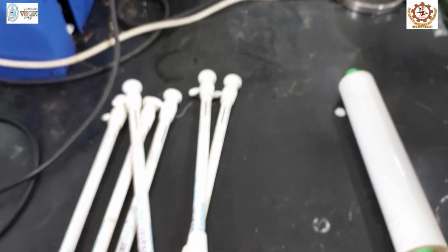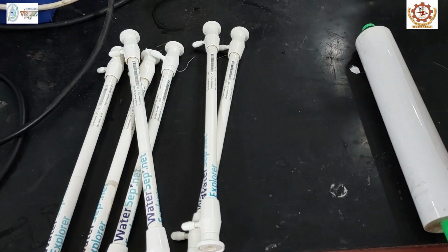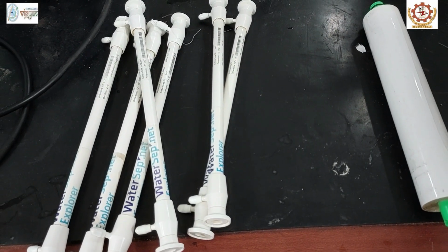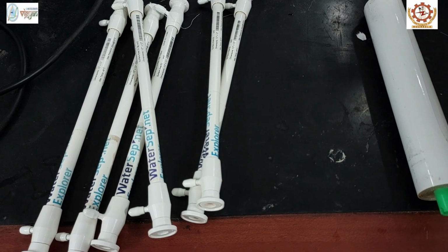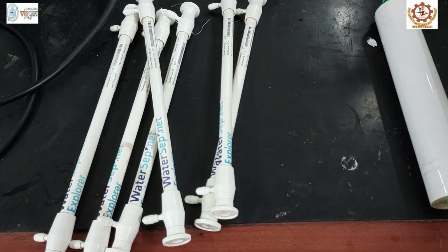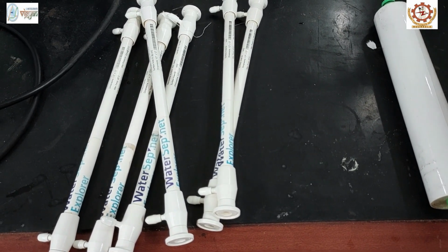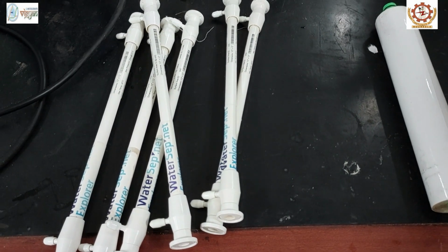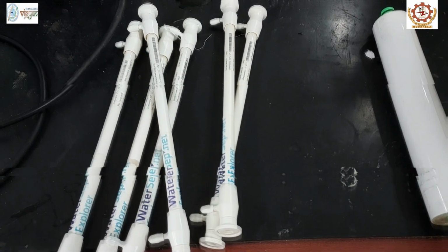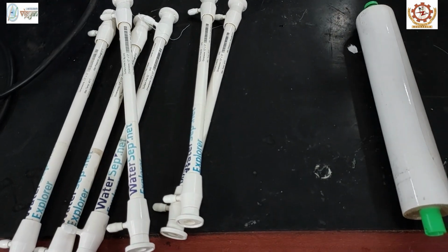The typical hollow fiber diameter is in between 0.2 to 3 mm and has a length in the range of 18 to 120 centimeter. However, the reverse osmosis fibers made using hollow fiber module are exceptional with a diameter as low as 0.04 mm but has a higher resistance to pressure than other fibers. These modules can operate in both inside out and outside inside mode.